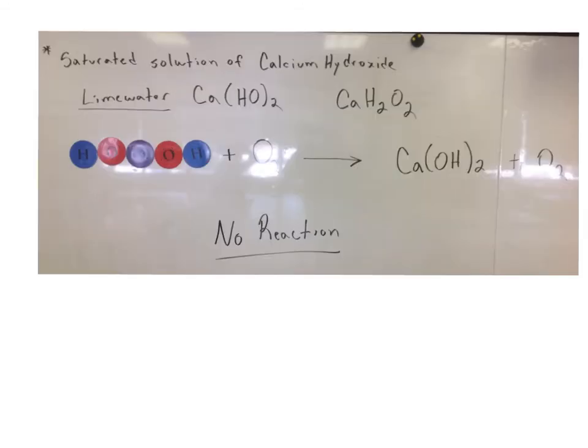When I was showing you putting air, oxygen, into the calcium hydroxide with the pump, this was a representation of no reaction. We have calcium hydroxide in, so this was Ca, 2 oxygen, 2 hydrogens, with this is O2, can't read it because there was a glare on the board, this is O2.